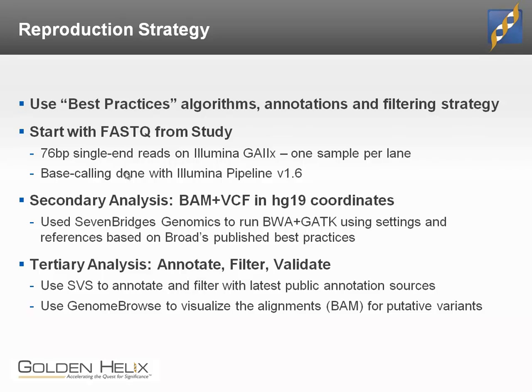So it is actually run on a cloud compute platform called Seven Bridges Genomics, and the pipeline is set up to reflect the Broad Institute's best practices; they publish GATK as an open source tool currently. So it has all that good stuff like base quality recalibration, local realignment of insertions and deletions, etc. So that's the first thing, is to get to the point where we have a set of variant lists that are produced with the best practices pipeline.